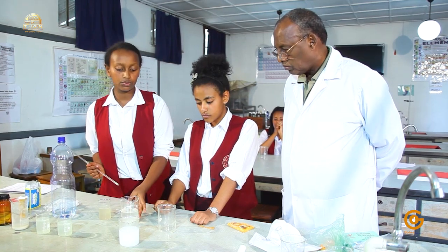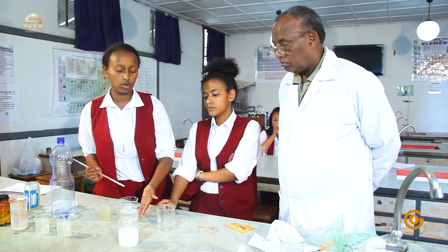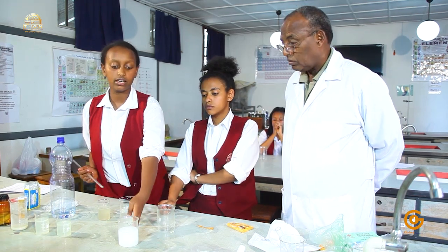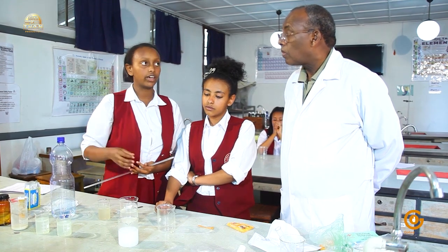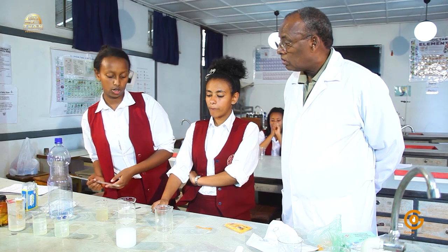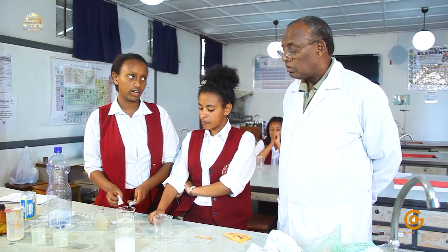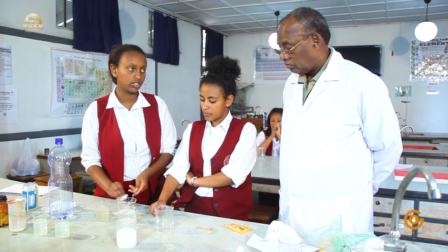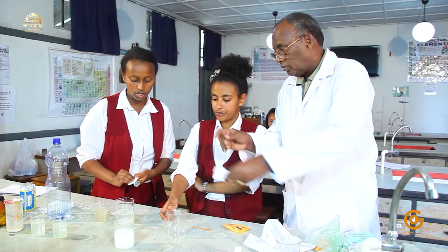But in the case of sodium chloride, it's just a physical change, meaning we're just dissolving it. But here, I think a chemical change is taking place, meaning that there's an emission of a gas, carbon dioxide. That's what we see over here. So we're going to stir our compounds and we're going to see which one dissolves faster and if there's any difference in the solubility. So you can stir with your spatulas like this.